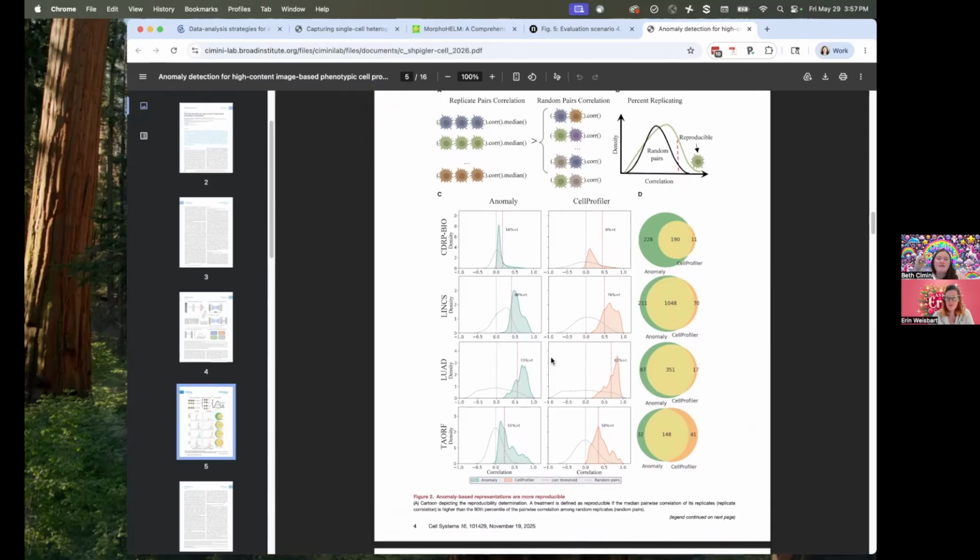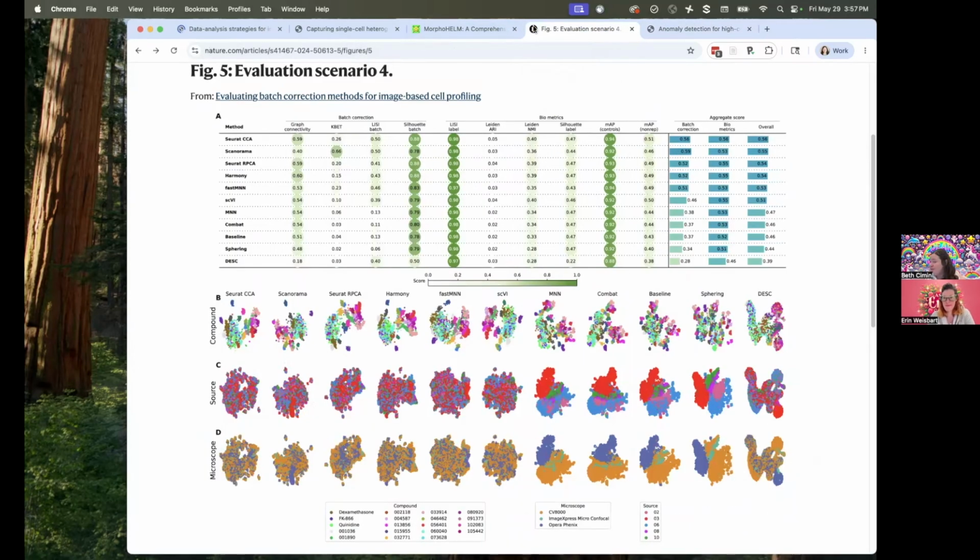But both the field of image-based profiling and the field of bioinformatics have really not settled on exactly the one best way to handle it, because how much you care that the shapes of the distributions are different might be really different in different scenarios. And so the answer to how you pick which one is a little bit vibes.